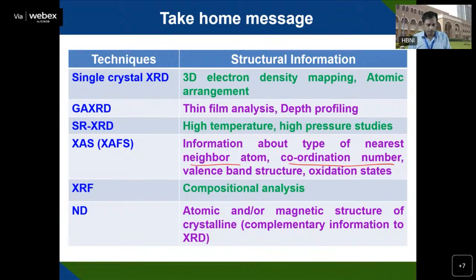So today I have mainly discussed all these techniques. In the next class, we'll discuss scattering. After X-ray absorption, X-ray diffraction and X-ray fluorescence, we'll discuss X-ray scattering and neutron scattering. Like X-ray diffraction, X-rays and neutrons can be scattered from bigger molecules. What we studied, X-ray diffraction and neutron diffraction, deals with atomic level study. For neutron scattering or X-ray scattering, that is small angle neutron and X-ray scattering studies, those deal with particles. We will study particle size and related information in the next class.